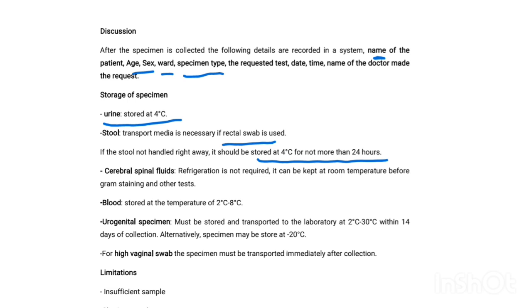It can only stay for a day. Then cerebrospinal fluid, which is CSF, has to be kept at room temperature. What should the room temperature be? It's between 20 and 25 degrees. That's where it should be kept.